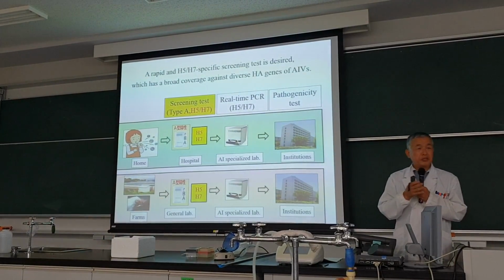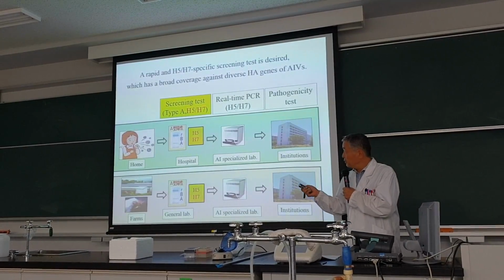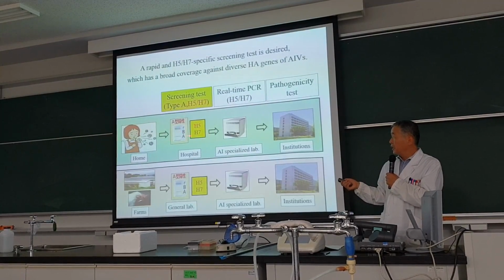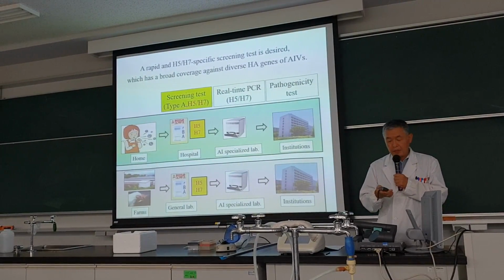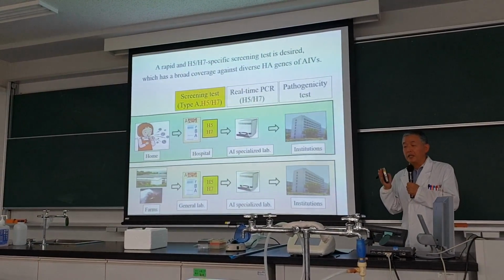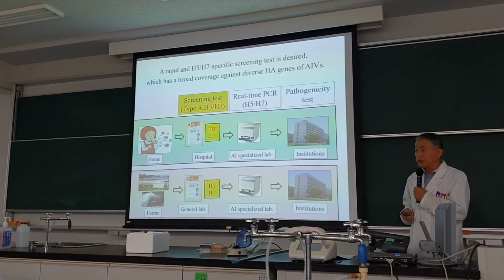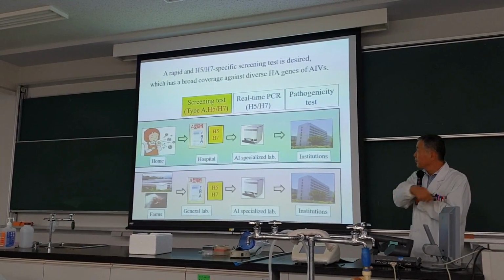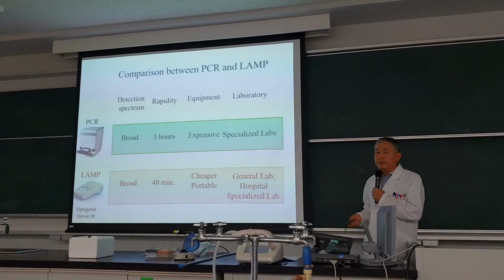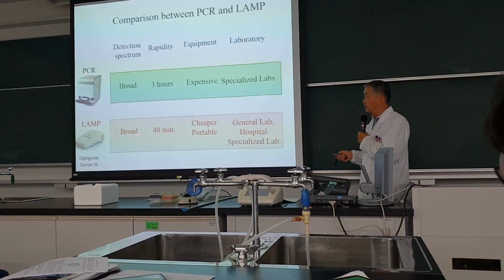We already have the PCR or real-time PCR, right? So if we can introduce the LAMP test as a screening test, if it is specific and sensitive and broadly reactive, the test should be useful, I guess, in the future. So when we compare, you are not familiar with the LAMP test. LAMP test is a genetic test for detection of the viruses.